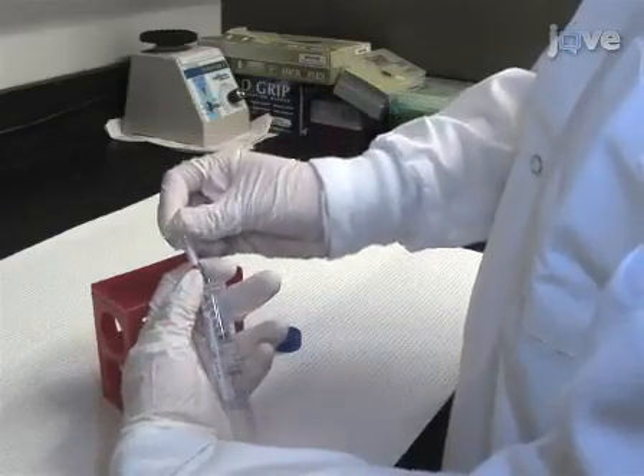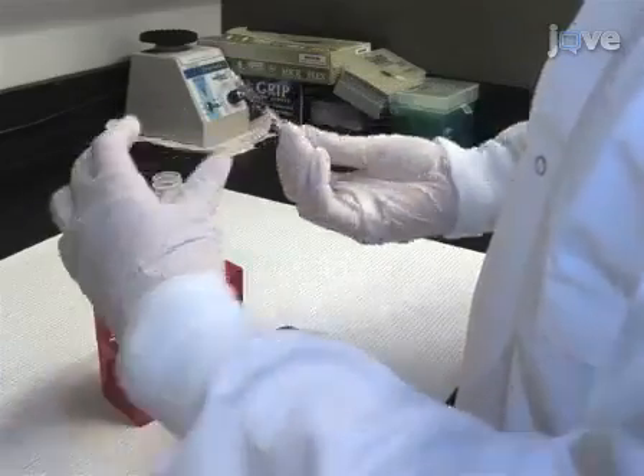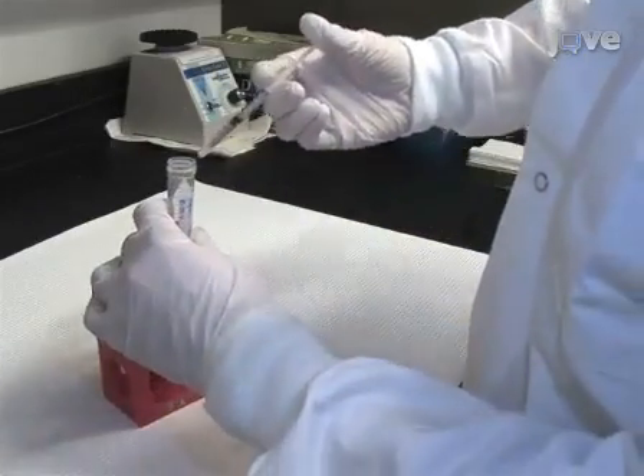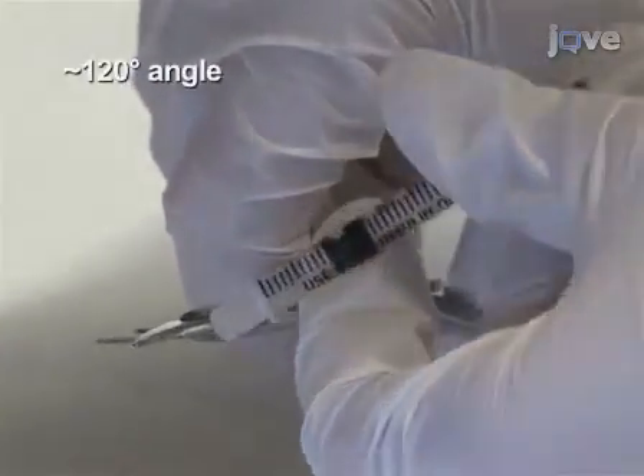Next, fill a half-cc insulin syringe with a 29-gauge half-inch needle with 0.1 milliliters of 1-to-100 heparin. Then bend the needle to approximately a 120-degree angle with the bevel up.